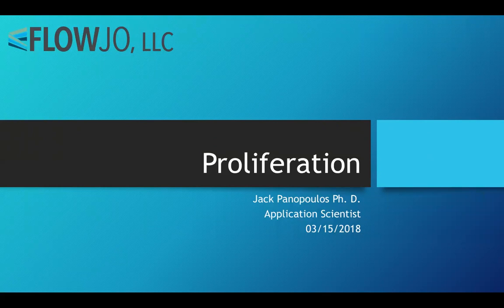ask a question during the webinar, and then after it finishes, I will come back and try to answer those questions one by one. Before we actually jump into FlowJo itself and start working with the model, what I would like to do is just go over a few of these slides, just to give you an idea of how to approach the experiment and some things to keep in mind when you're doing these types of experiments.